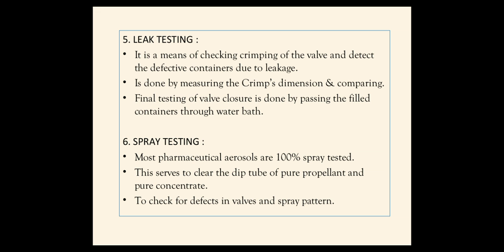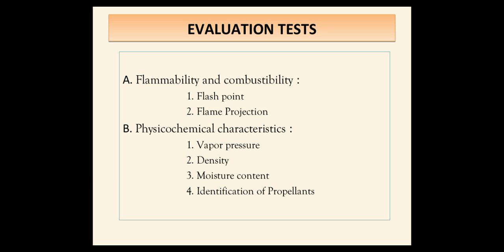Spray test. Most pharmaceutical aerosols get a 100% spray test. This serves to clear the dip tube of pure propellant and pure concentrate, and to check for defects in the valve and spray. So this is the evaluation test, or pharmaceutical testing. Another name is the pharmaceutical testing of aerosol.